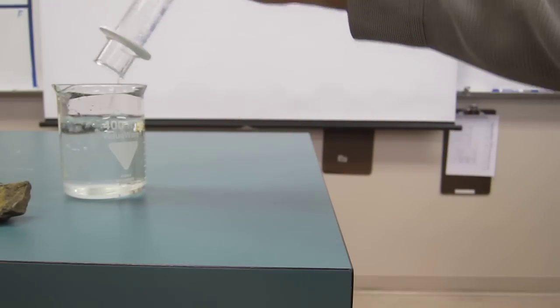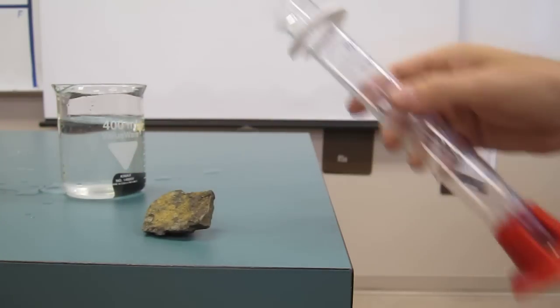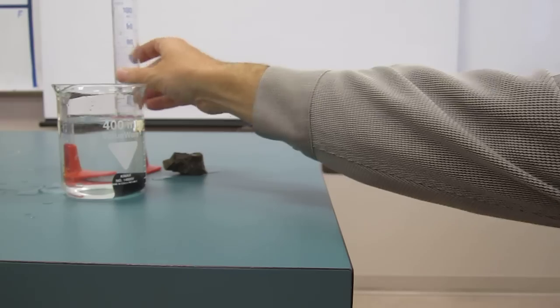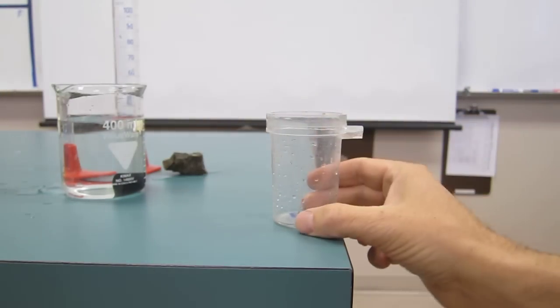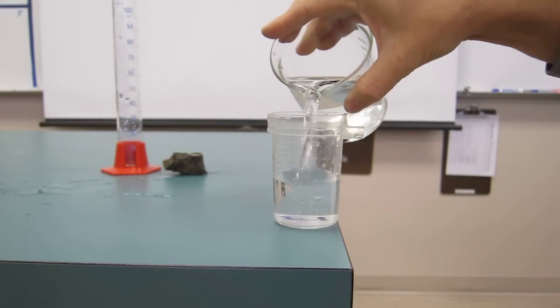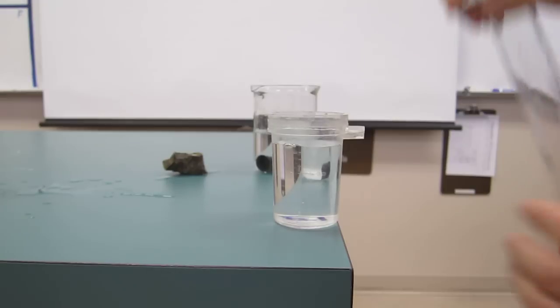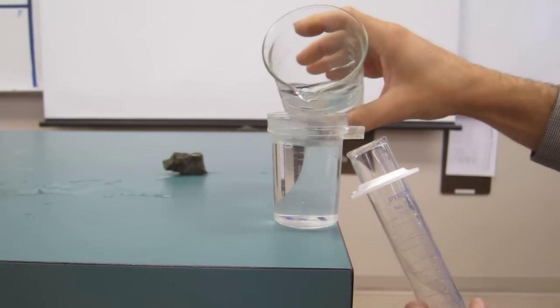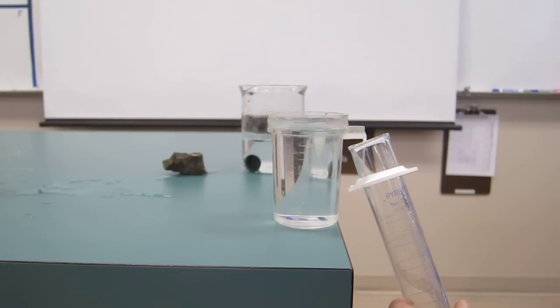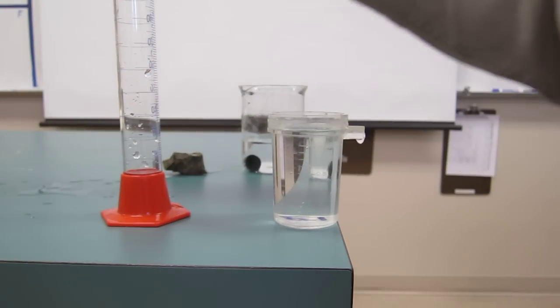The next thing I ask you to do is figure out the volume of a rock. Here's a rock. Problem is, the rock won't fit in here. So students problem solved and figured out that they could fill up something called a dribble cup. So you just fill that up with water. It's going to dribble out, so I'm just going to catch it with something here. Catch it with this since I already have it. Let it stop dribbling. And then I'm going to get an empty graduated cylinder.